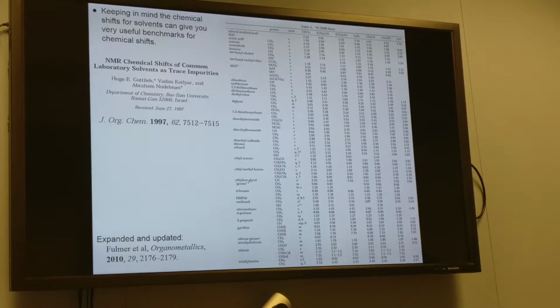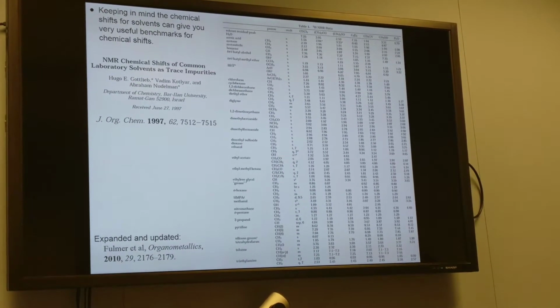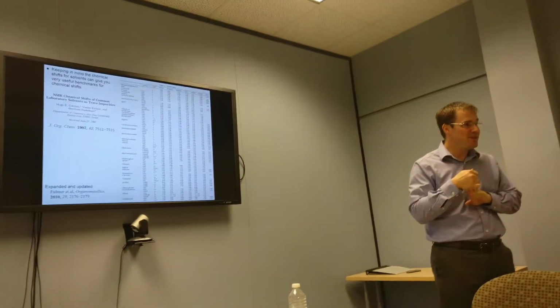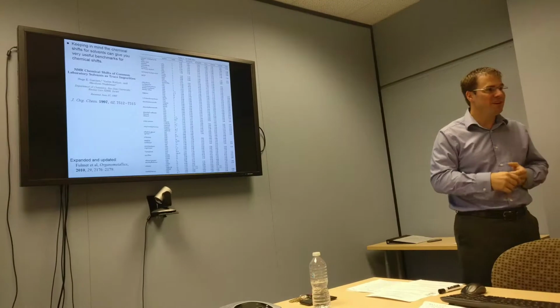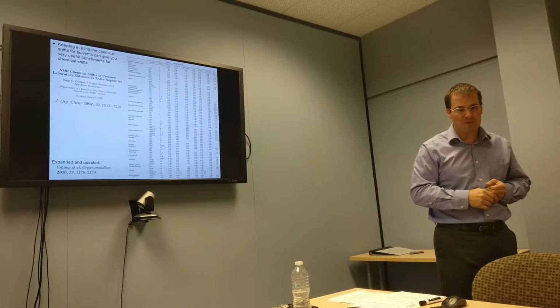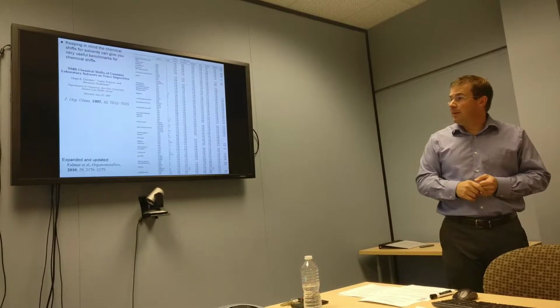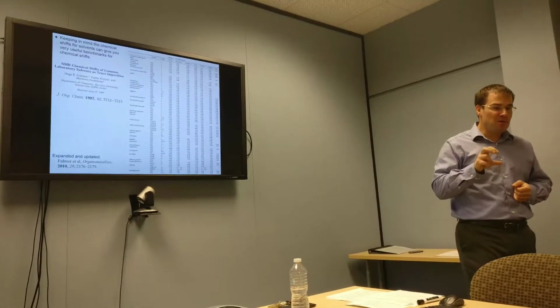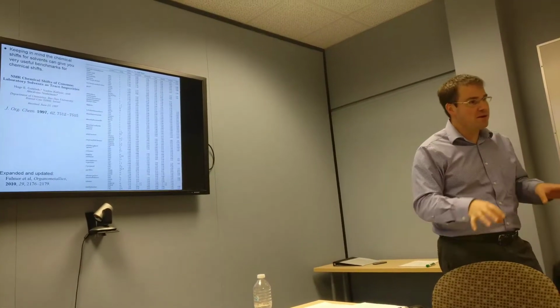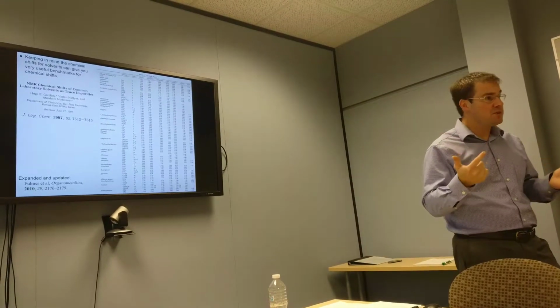So I think all of you probably have a pretty good idea of where ethyl acetate comes in the NMR. Probably all of you have a pretty good idea of where grease comes in the NMR or where THF comes in the NMR, because you see this stuff if you haven't washed your dishes appropriately or left it on the vacuum pump long enough. Dimethylformamide you see in the NMR, okay? And so if you can remember where all of these solvent chemical shifts appear, that actually gives you a pretty good mental handle for where different functional groups appear.